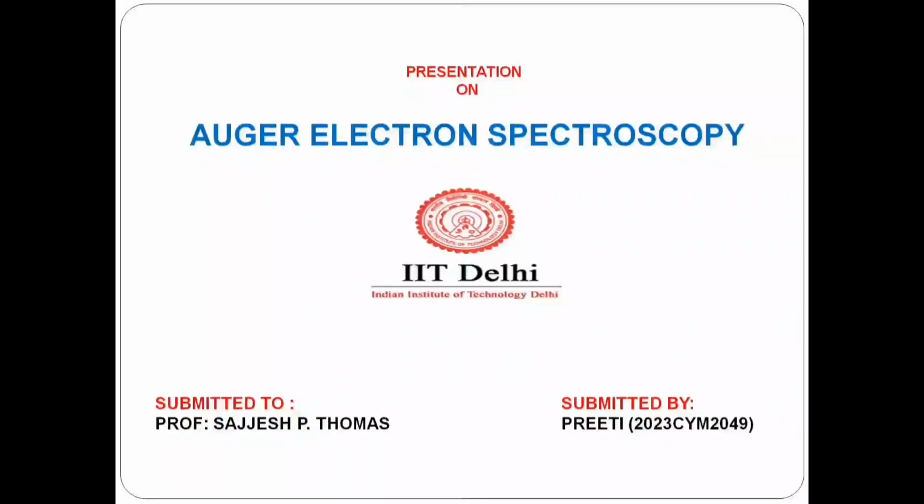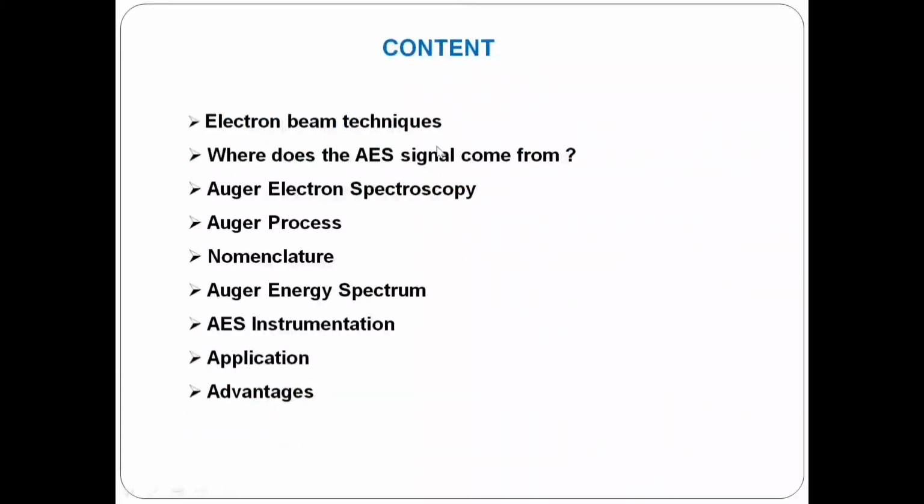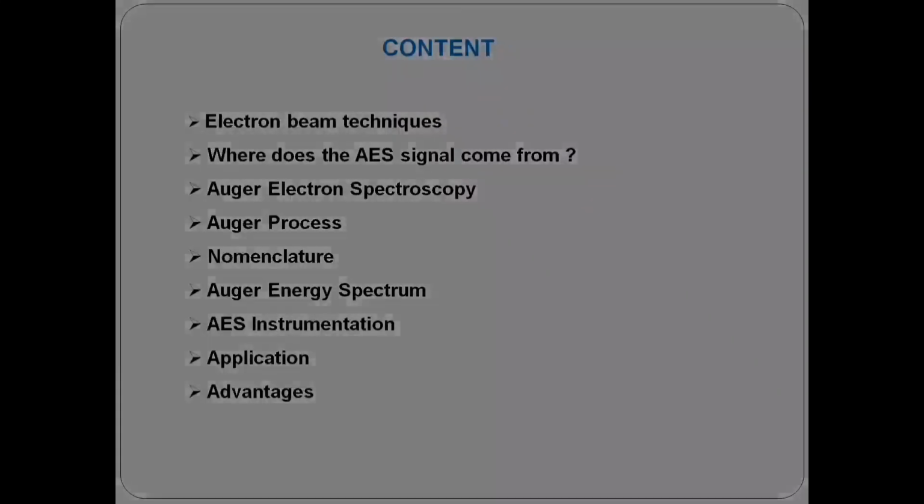Hello everyone, myself Preeti. Today I present a topic, Auger electron spectroscopy, in which I explain what electron beam techniques are, where the AES signal comes from, Auger electron spectroscopy and its Auger process, its nomenclature, energy spectrum diagram, its instrumentation, application and advantages.